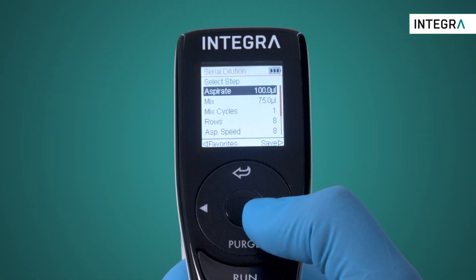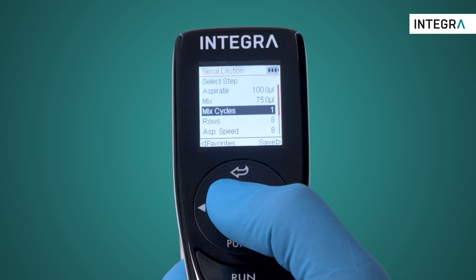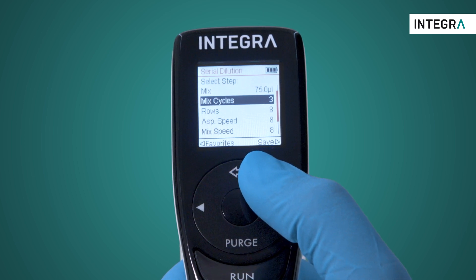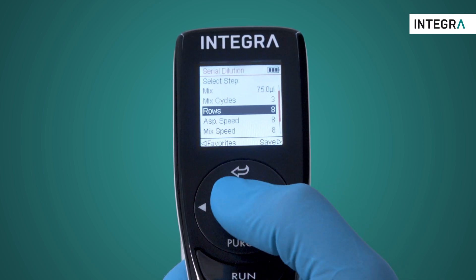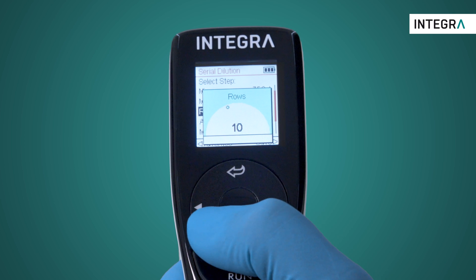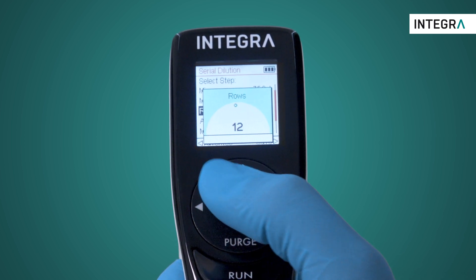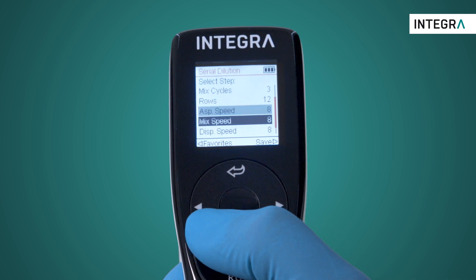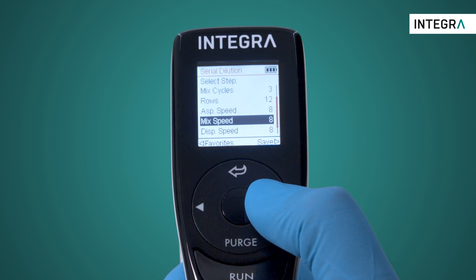Other factors which can be changed are the number of times the mix is done in each well — generally, the higher the number, the more homogeneous the mix. The number of rows in a plate can be set to the full plate, or 12. The speeds of aspiration, dispense, and mix can also be individually adjusted depending on the liquid type.